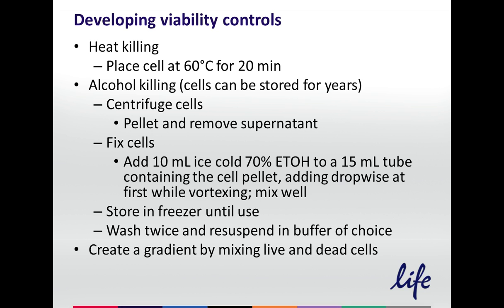Sometimes it's not particularly easy to do an alcohol kill or a heat kill if you're in a plate format or you've maybe got dishes. So you can also just use very high concentrations of a drug like camptothecin at about 40 micromolar for 24 hours, or 100 micromolar valinomycin for sort of 5 to 6 hours, and that should give you a pretty good complete killing of a population of cells. And as I say, that's often easier if you can't subject one part of the plate to heat, or if you're not able to use ethanol in a very controlled fashion.